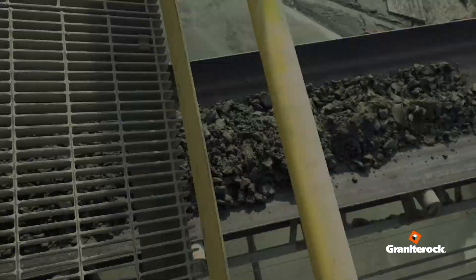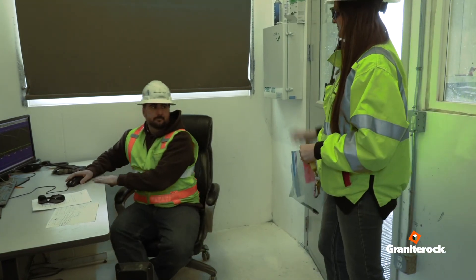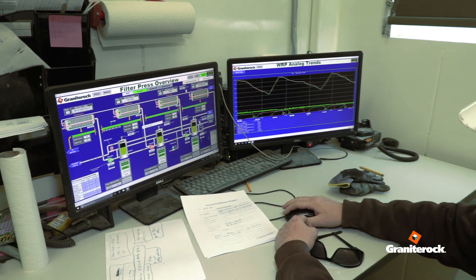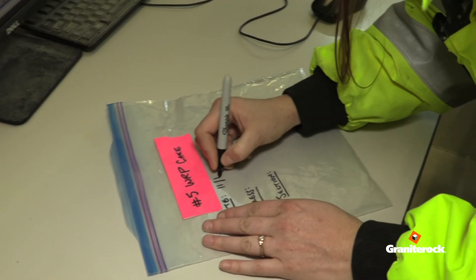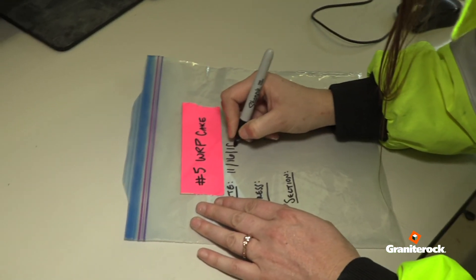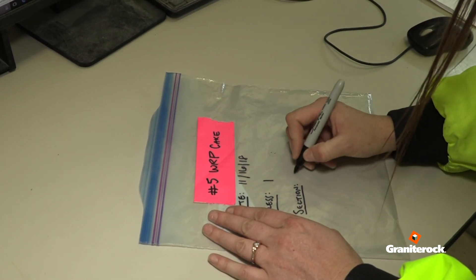Sample number five: request a sample of filter cake from the plant operator. The operator will shut down the belt for you to collect the sample. Record the press number and press section on an empty sample bag, in addition to the date and time of the sample collection.